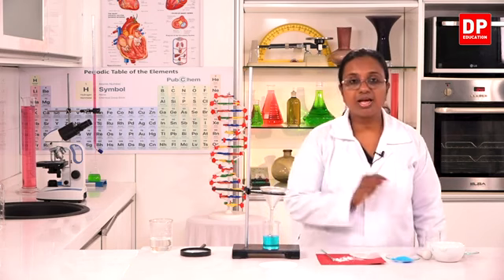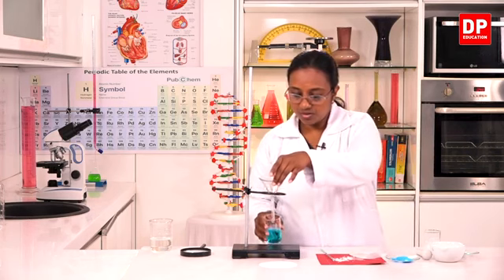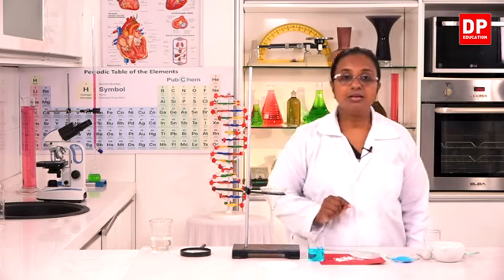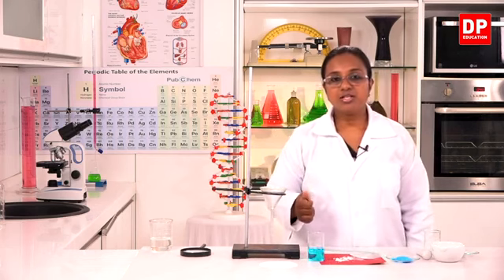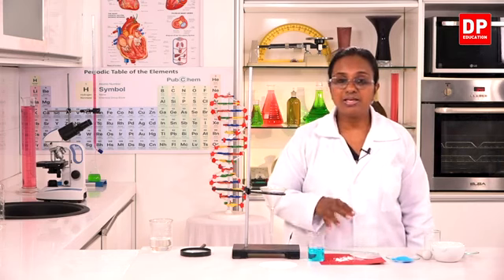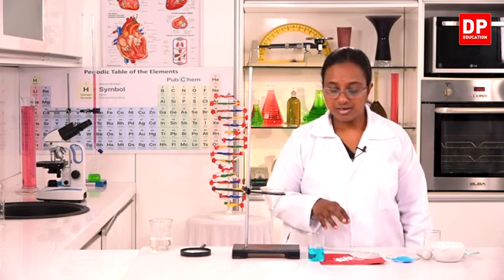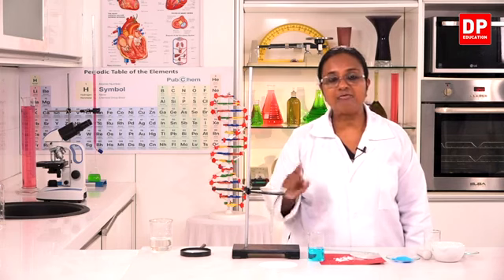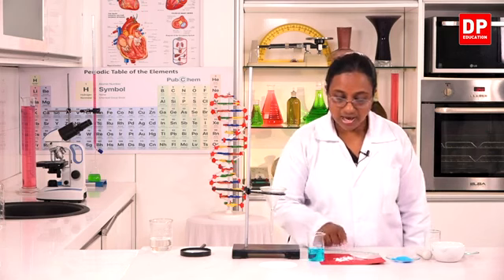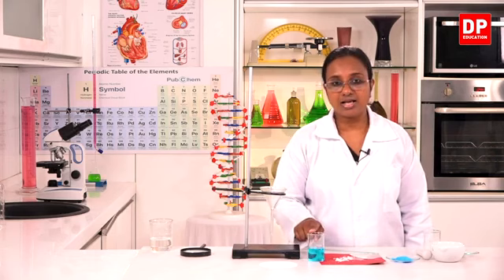And here, as you can see, copper sulfate is blue color, and we have got the full copper sulfate into this beaker. First we had the two substances individually, copper sulfate and naphthalene. We mixed them together, got the mixture. Couldn't identify the components separately, then we dissolved it and filtered it, and by doing this physical separation, now we have the two components separately, naphthalene and copper sulfate.